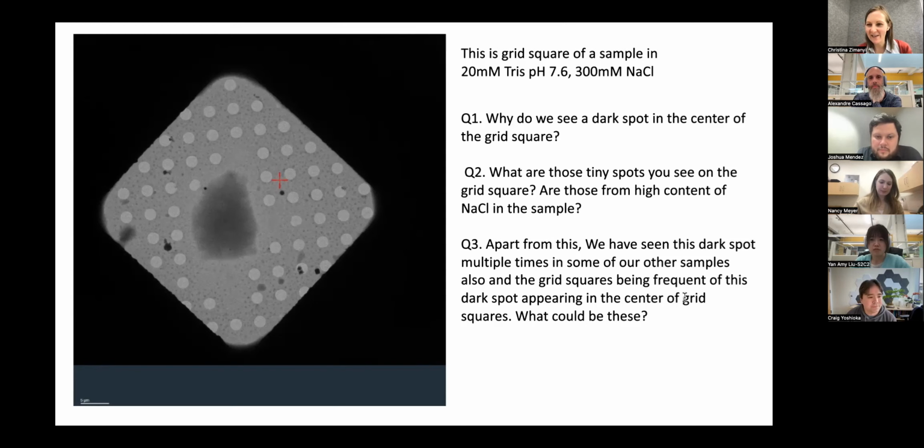Yeah, and I'll just recap a couple of comments that are coming through on the chat. Ewan, thank you for telling us. Also, you've noticed that changing glow discharge times can sometimes change this kind of behavior. And then someone mentioned they see this often in Chameleon grids more than Vitrobot grids. But I've definitely seen it on Vitrobot grids as well. So I think all types of grid prep may cause this.